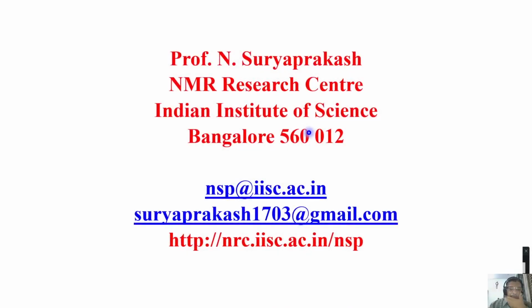Welcome back. In this class, I would like to give you a brief idea about what an NMR spectrometer is. There are several components, several parts in an NMR spectrometer. Each will do its own job.